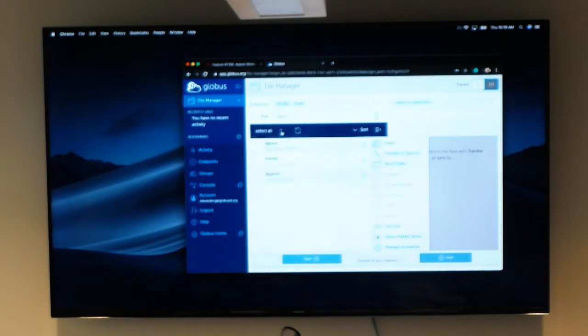If you're collecting data on a Krios and you're running the Appion pre-processing, in that same folder, you'll have the MotionCor2 outputs, meaning the aligned sums that were dose weighted. The raw data is in your frames folder.